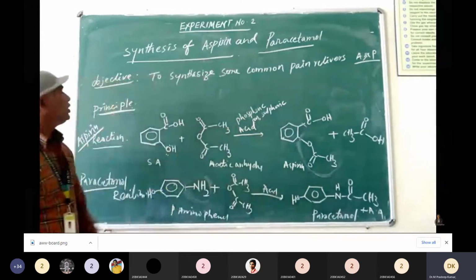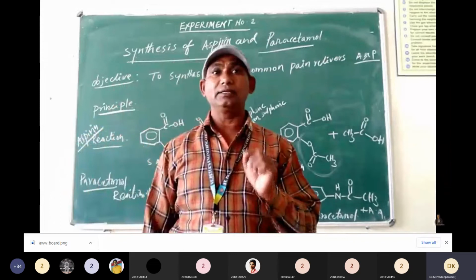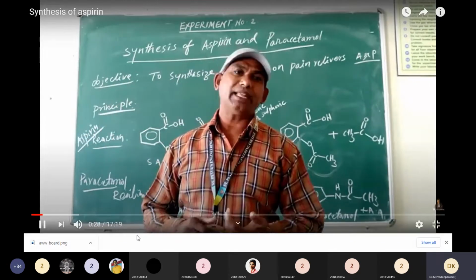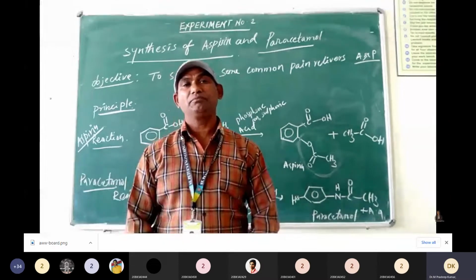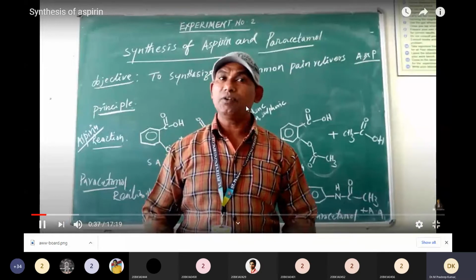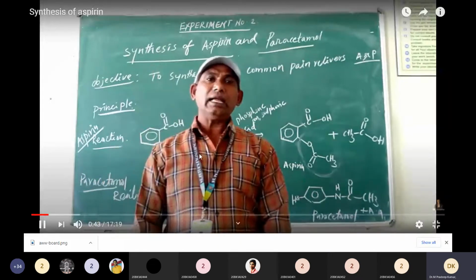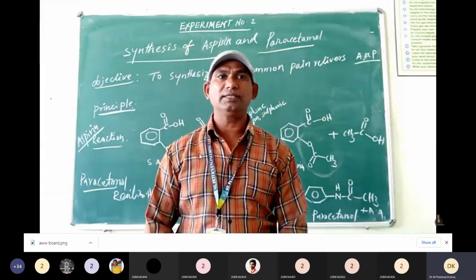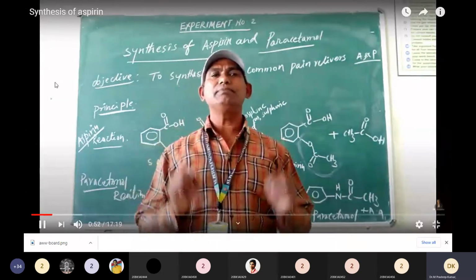What is the objective? The objective is to synthesize some common painkillers like aspirin and paracetamol. Paracetamol tablets are used for reducing fever. Most companies in Hyderabad as well as various countries prepare them at very low price. Why? It's a simple preparation.